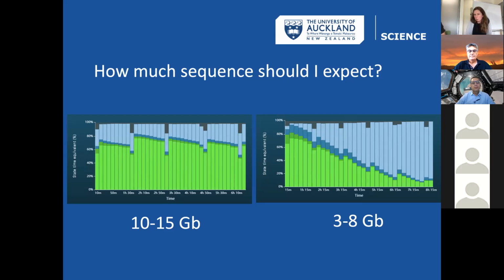But a lot of the samples that we do are a bit more problematic. They do block pores, and there the amount of functional sequencing capacity of your unit can decrease quite quickly, and then you will get less out in the end. And sometimes that's intrinsic properties of the sample, and other times it's actually something a little bit different.